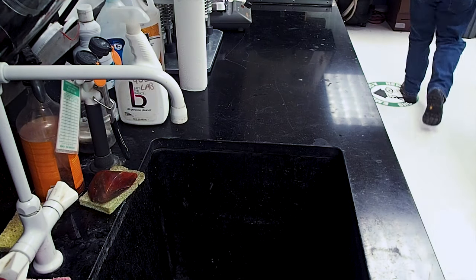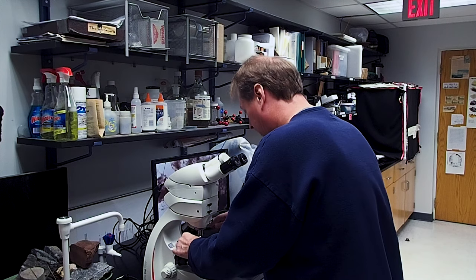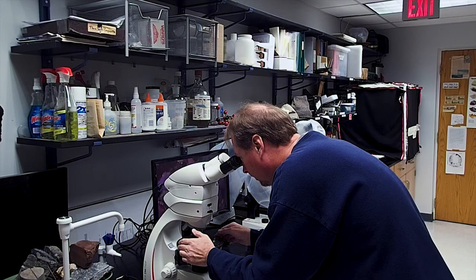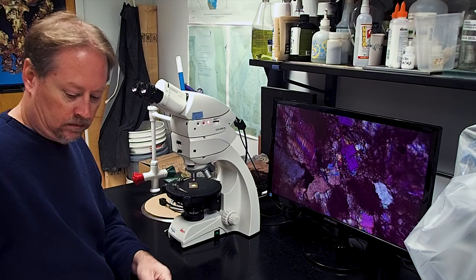Next, place the slide beneath the microscope and see if you can identify any minerals in the thin section. Typically you want to look for common and easily identifiable minerals such as quartz, feldspars, or micas in your sample. But the occurrence and abundance of these minerals is obviously going to vary.